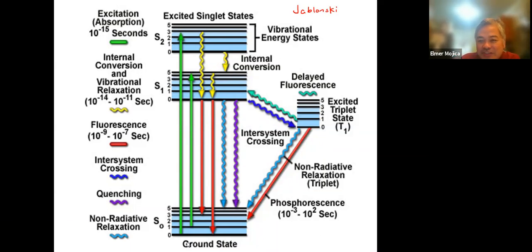So you see there an ski, just like Jaworski. So yung ethnicity niya is more on Polish. So this Jablonski diagram shows you the different processes that happen. And as you could see here, it's just the same as what I discussed earlier.